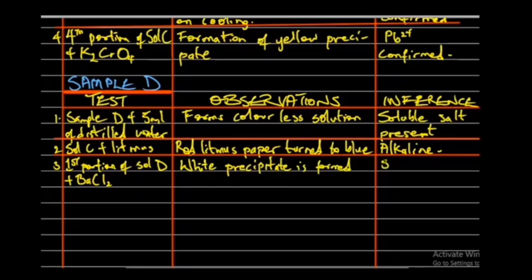That probably suggested that we have SO4 2- present there. We also suspected SO3 2-, and CO3 2- carbonate. All of these were ions that were suspected.